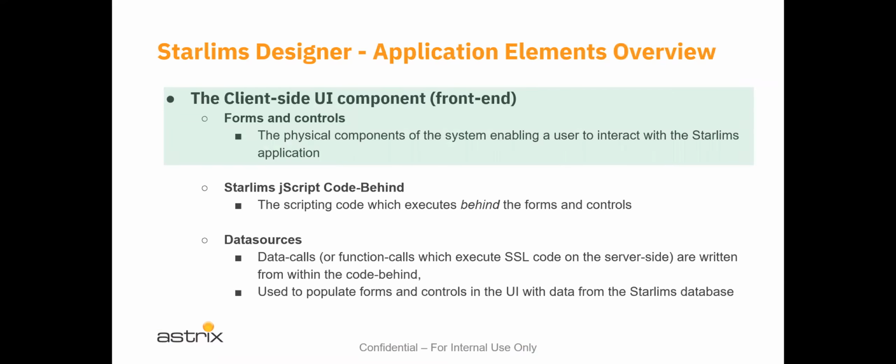The client side, the front end, hosts all of the forms and the controls and the client-side scripting that occurs on those forms. In STARLIMS, we refer to that as the JScript code behind, and that occurs behind every control, behind every form, and behind every data source. There are all sorts of different factors related to the scripting code, which executes in these forms. We're going to look at that in the designer towards the end.